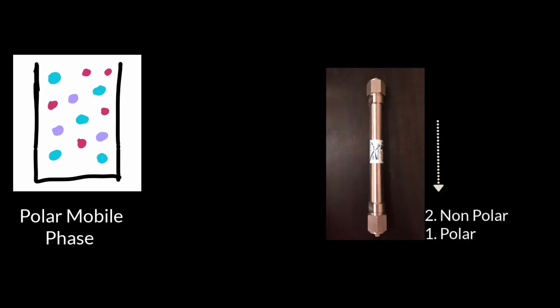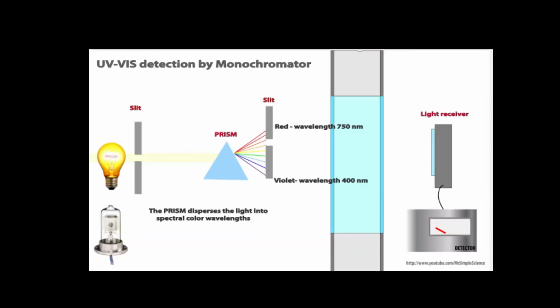After the analytes come through the chromatography column and are separated, they enter the photodiode array. The photodiode array has a small window that allows light of various wavelengths to travel through it. UV-vis spectrophotometry will be used to detect the analytes.